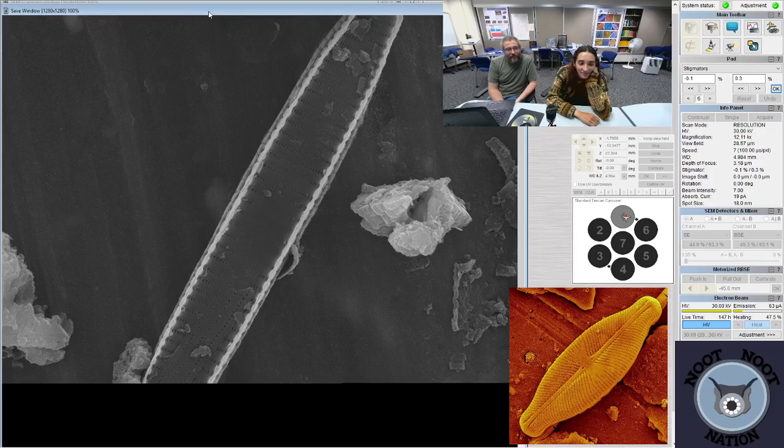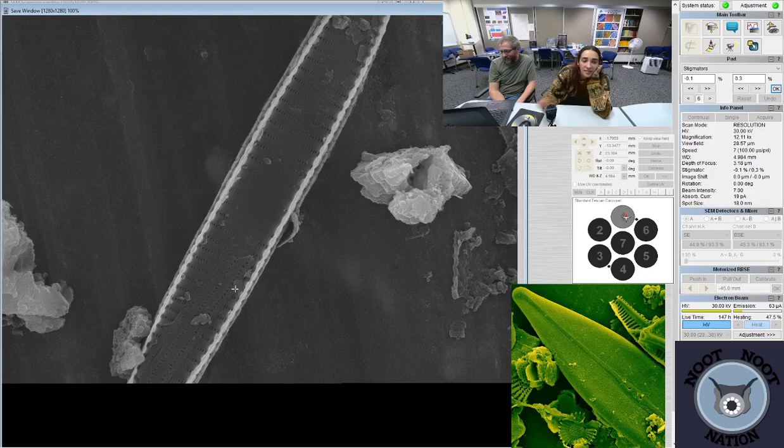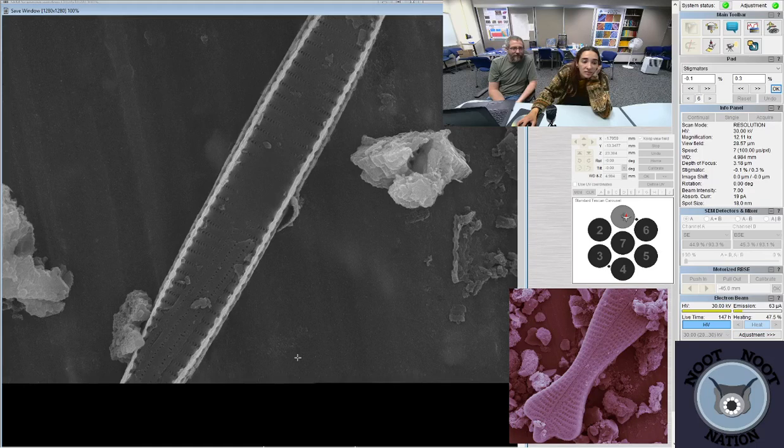You see, it has a girdle band laying in the valve right here. Yeah. Not ideal, but it's its own girdle band or it's someone else's? I don't know. Hard for me to tell. I mean, it probably is its own, but it could be anything.